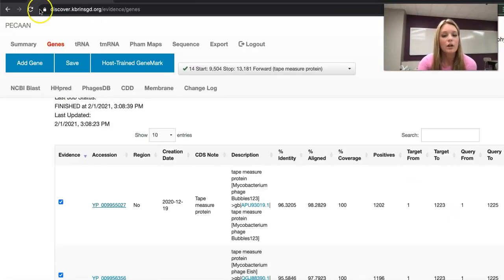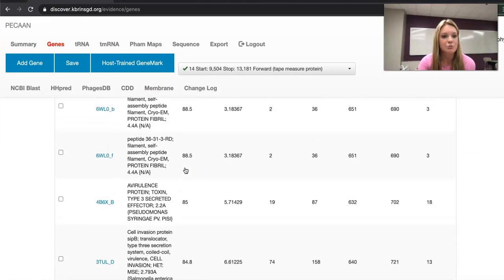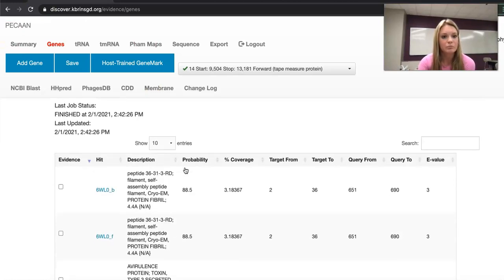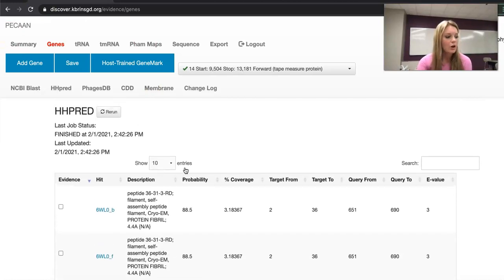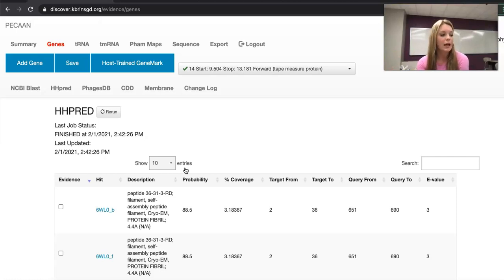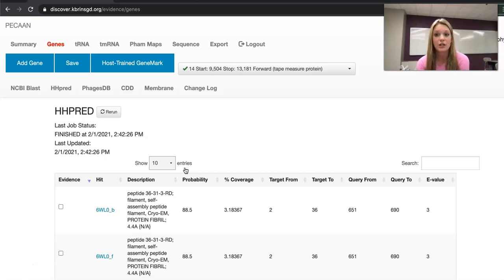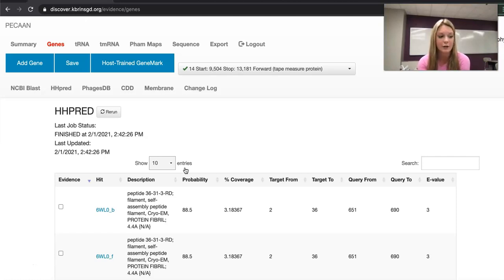Now let's talk a little bit more in depth about HHPred. Going back up to HHPred, let's get a little background information. Basically HHPred is another database used to compare similar genes. It compares genes in the same family with the gene being annotated.